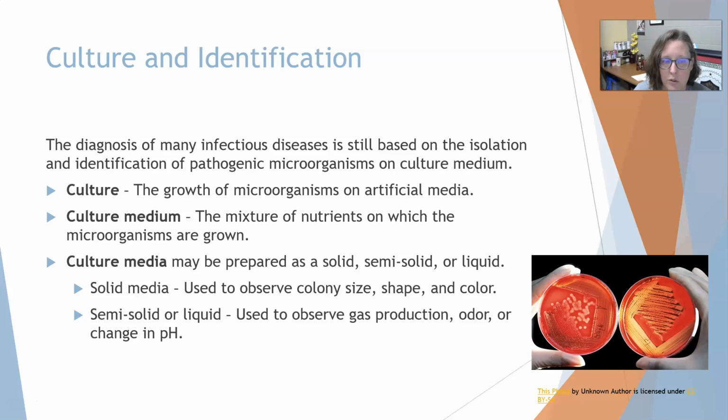The culture is the growth of microorganisms on artificial media, such as these agar plates shown here. We want these microorganisms to grow to where we can see the colonies with the naked eye, and then we can do tests on the colonies. The culture medium is a mixture of nutrients on which the microorganisms are grown. I'm going to go over those in a minute. But culture media can be solid, semi-solid, or liquid. These agar plates are considered solid. Semi-solid would be more like a gel, if you will. And liquid would be like a broth.